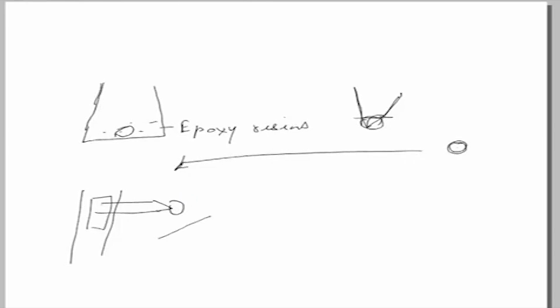There will be a blade or a diamond knife or a glass blade could be utilized. Now, this one has a property that it will give much thinner ultrathin sections, like I said, than the simple microtome. So, this is ultramicrotome, and it could be placed in cold conditions if certain cryo techniques have to be used, that we will discuss later on.